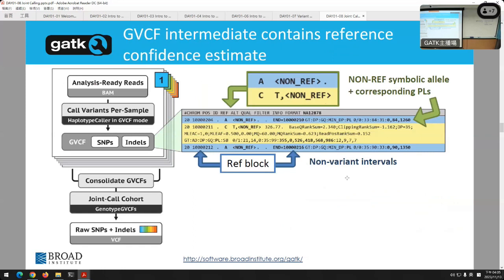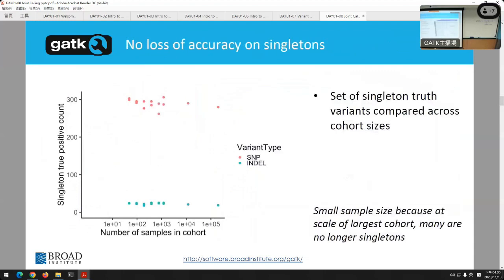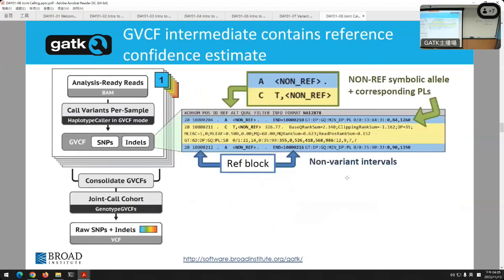Remember that case we mentioned a few slides ago of potential Alzheimer's? If you're looking across the population, when you're looking at maybe statistics of mutation there, it's one thing to say, oh yeah, that person's ref. They're fine. That's another count for ref. It's another to say, we don't know what that person is. We have no idea. So when you're trying to figure out how likely a variant is, you can't count it toward ref just because we can't call it a variant. The truth is we don't know what it is. It could be anything. And that's information that the GVCF maintains. It still tells us, not just is there a variant, but do we really know what's going on?